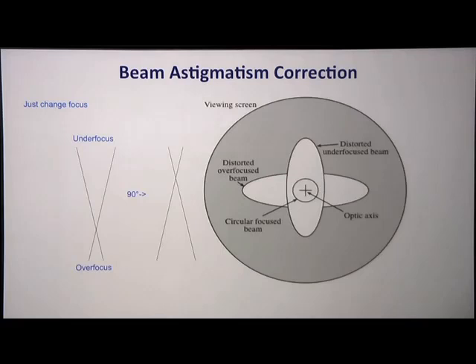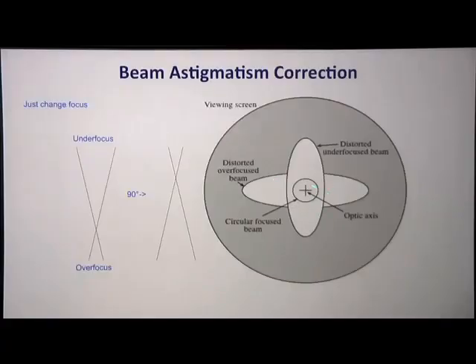We also talk about stigmation in terms of electron beams. Ideally we have a nice round beam that will illuminate the sample uniformly. But if it's not round, oftentimes it's caused by stigmation. One way to stigmate an electron beam is to change the focus of the beam with respect to the sample. You'll see an ellipse on one side. You come through focus and it'll be a circle, and then it flips to an ellipse on the other side. This is exactly the same thing. You're looking at that stigmation going back and forth. Ideally, you use the stigmators to correct for this until you have a nice round beam going through the convergence point. This is another alignment that you'll do ad nauseum if you use electron microscopes a lot.